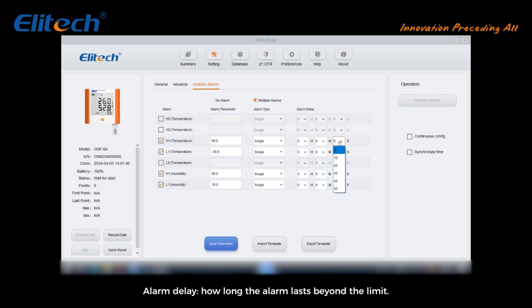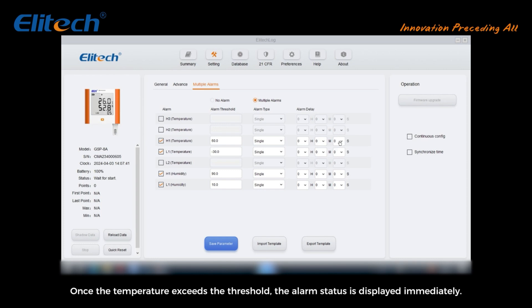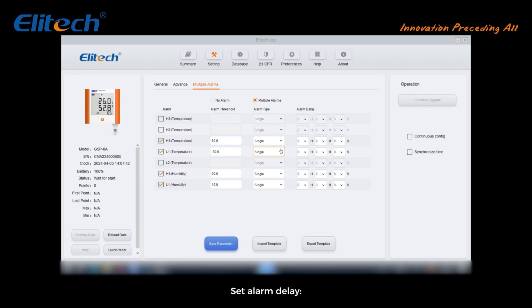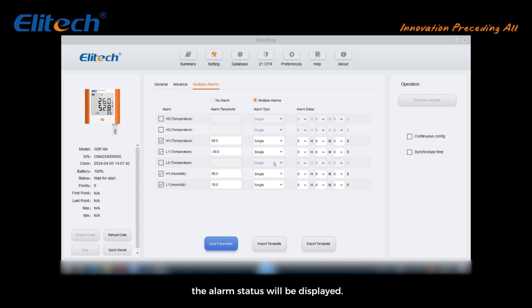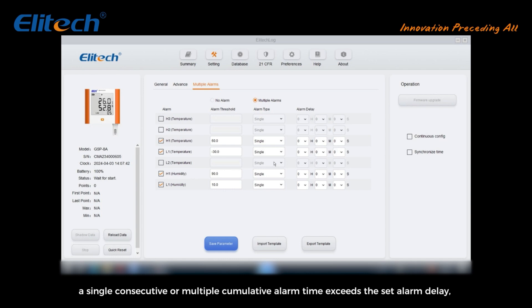No alarm delay: once the temperature exceeds the threshold, the alarm status is displayed immediately. Set alarm delay: one, single alarm. A single consecutive alarm exceeds the preset alarm delay, the alarm status will be displayed. Two, cumulative alarm. A single consecutive or multiple cumulative alarm time exceeds the set alarm delay, the alarm status will be displayed.